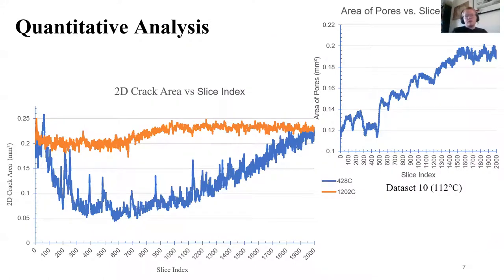So on the left and right here, we have, of different datasets, the areas of pores versus slice index. All that's meaning is, it's a depiction of the different area of your pores over the sample. By inspection, you can very clearly see that there are sometimes dips of that area before large increases.